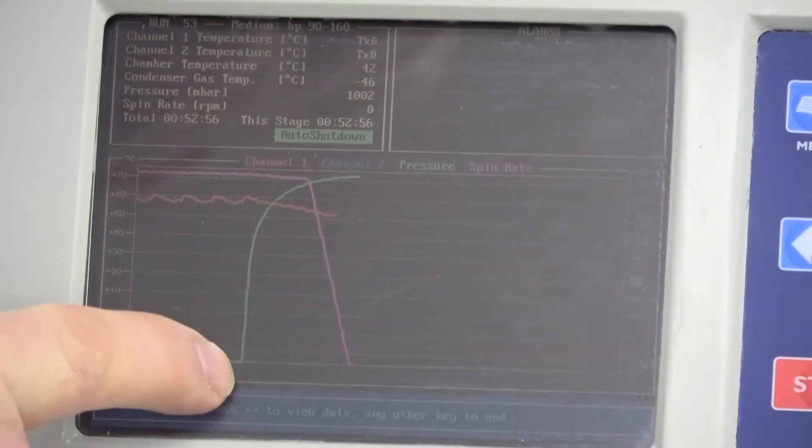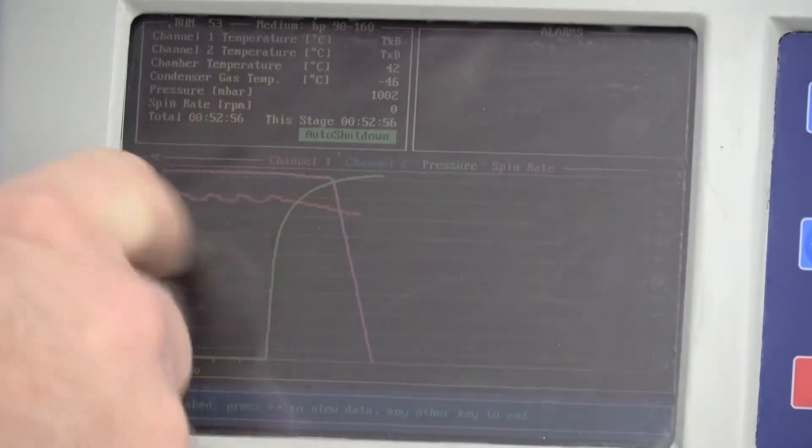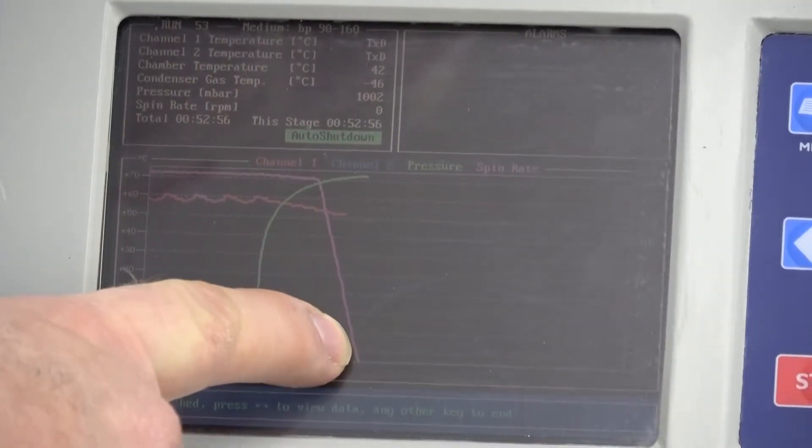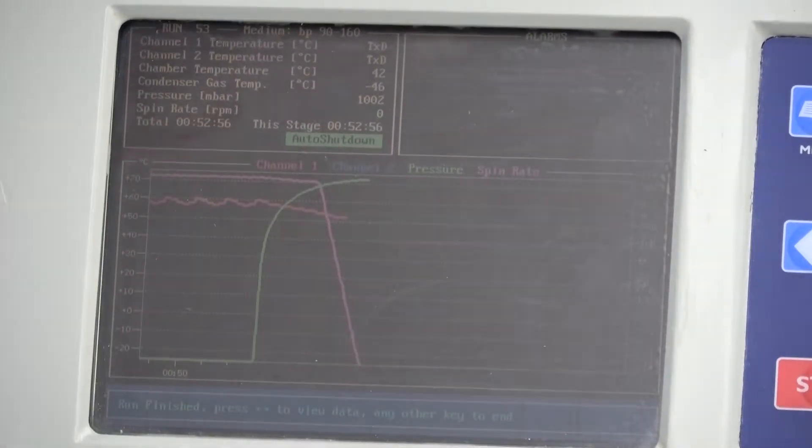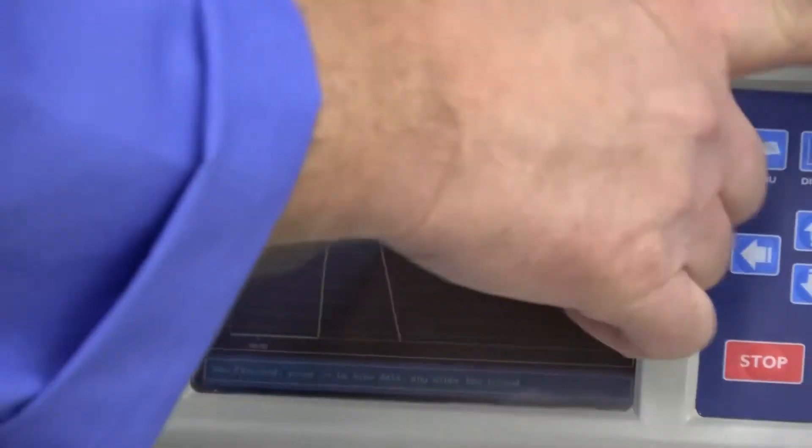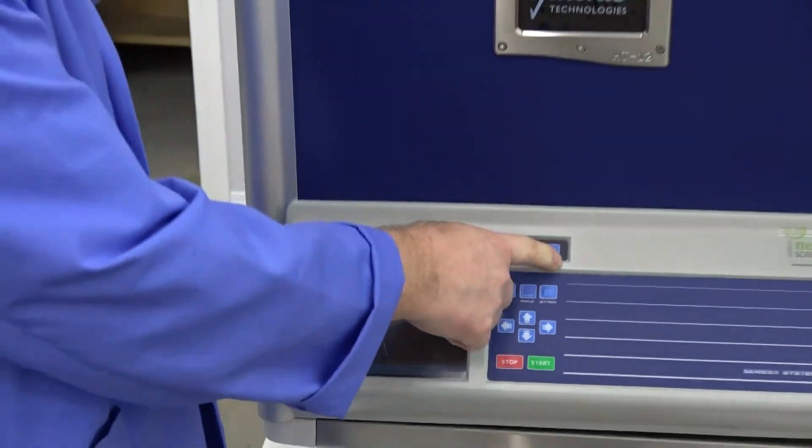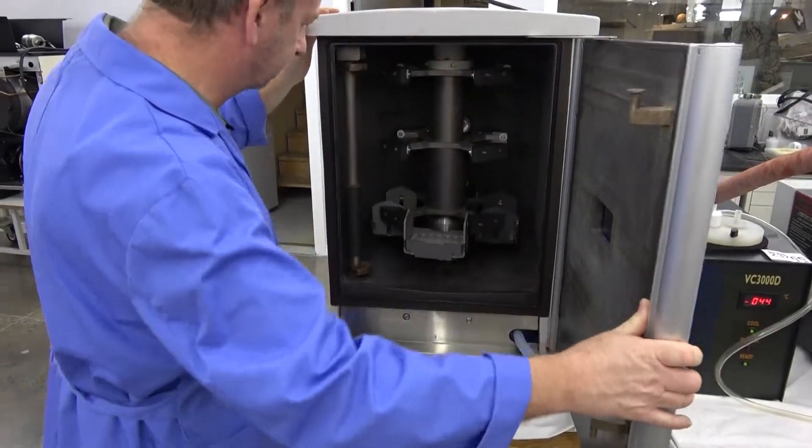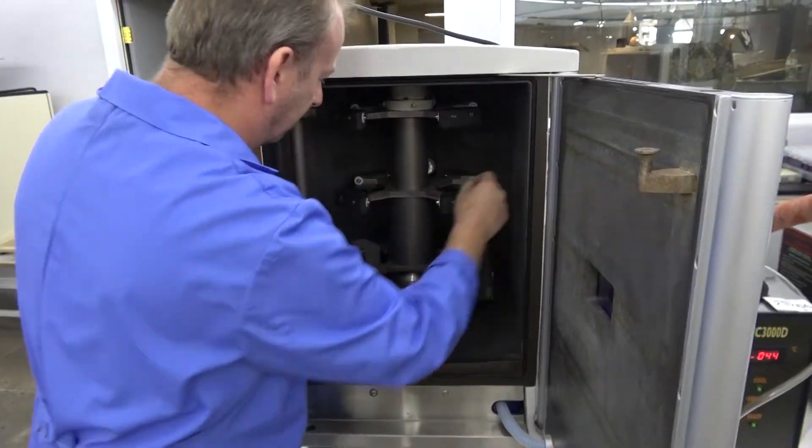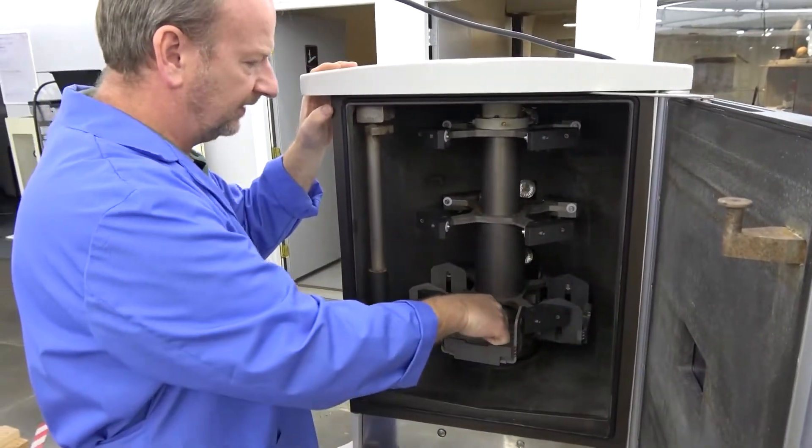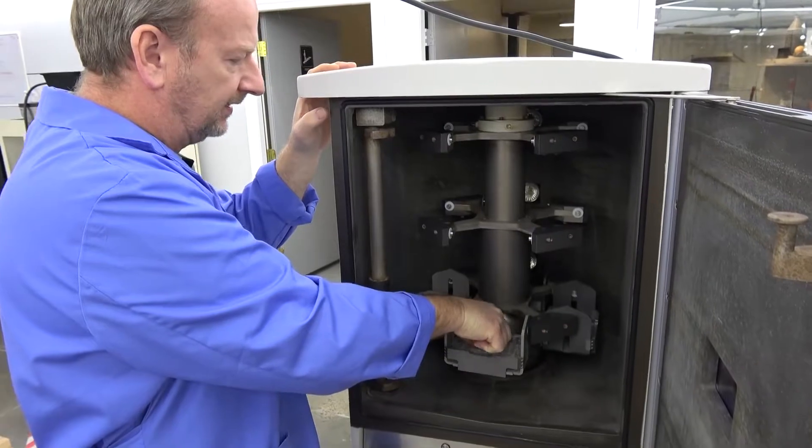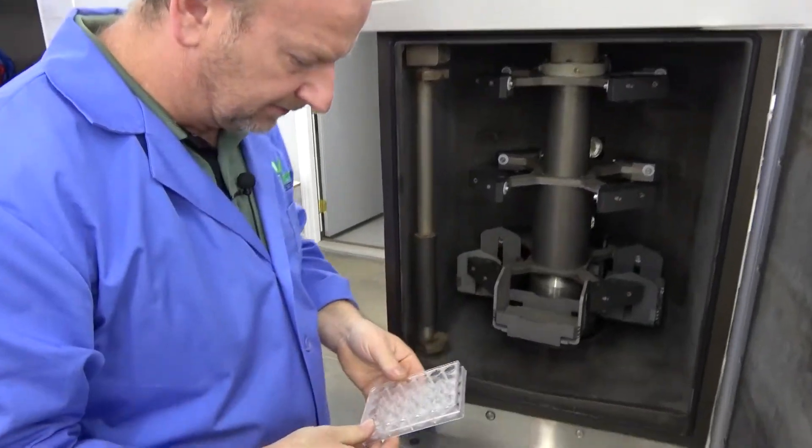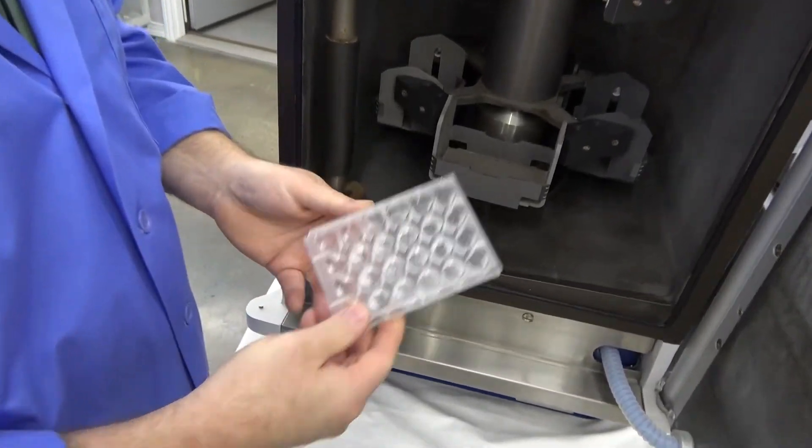But once I shut it down, of course, the vacuum all bled off here, and then the heat also dropped. But anyways, we're going to go ahead and open this up and take a look inside. It's really nice and warm in here because I ran the temperatures fairly high. But as you can see, we don't have anything left, some powder residue.